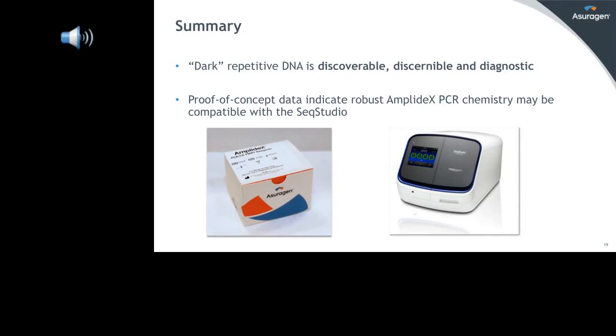So that's a good question, and it really speaks directly to the nature of the specific assay and what the target locus and specifications might need to be for the given purpose. So some of the targets that I mentioned are relevant for large-scale sample analyses, and in those cases you really would want to be able to look at many samples at a time and process those in a relatively high throughput manner. The assays themselves are highly scalable, so you have the capability to run these at larger densities.